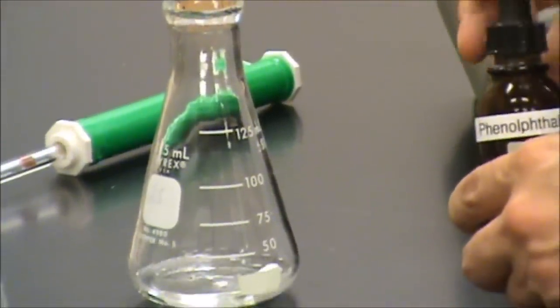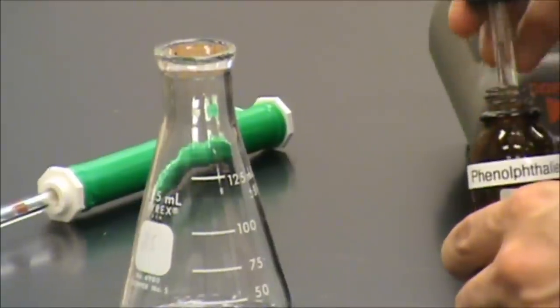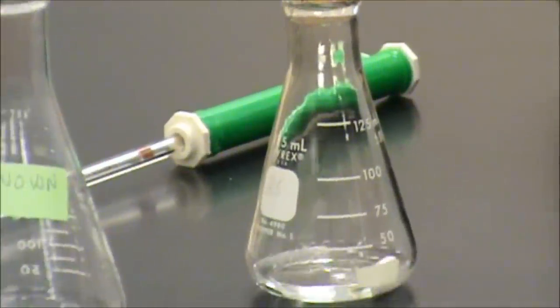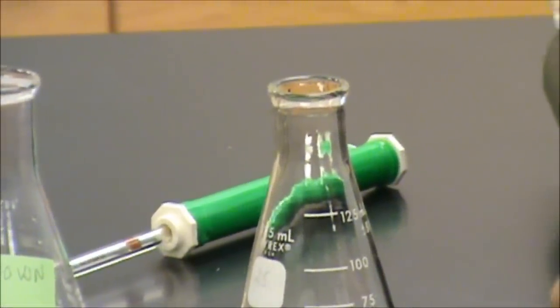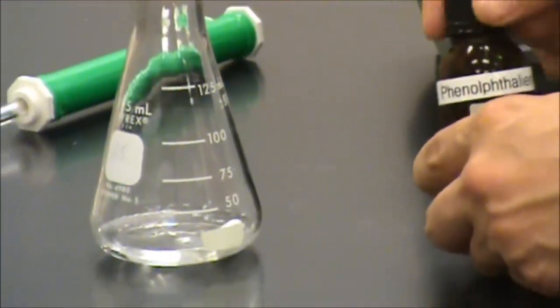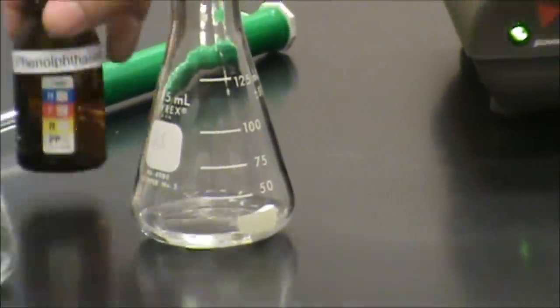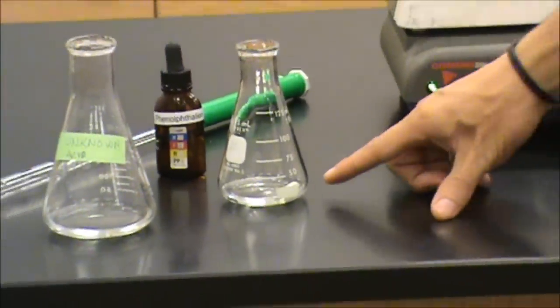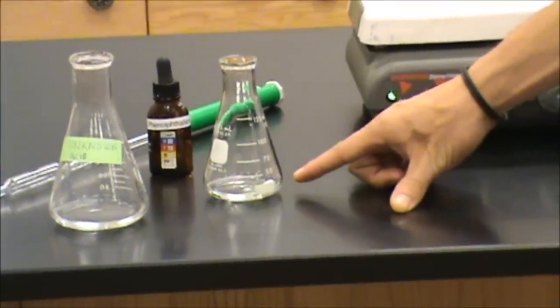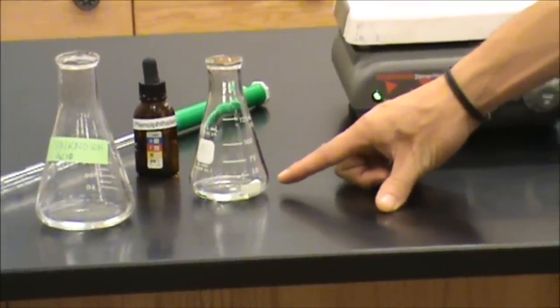The indicators will come in dropper bottles such as these. We want to add the amount of drops indicated by the procedure. Generally, just a few drops are required. For this particular indicator, you'll notice that it's colorless, but we will see a dramatic color change when we reach the end of the titration.